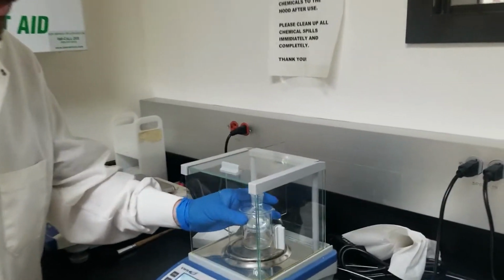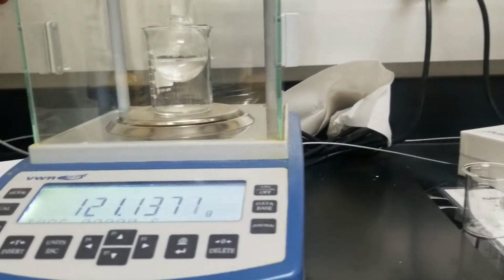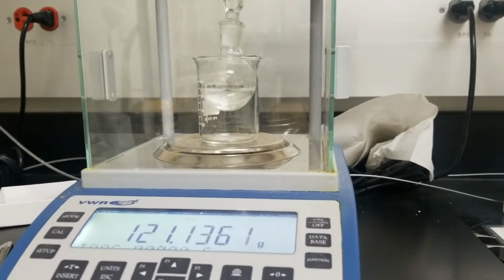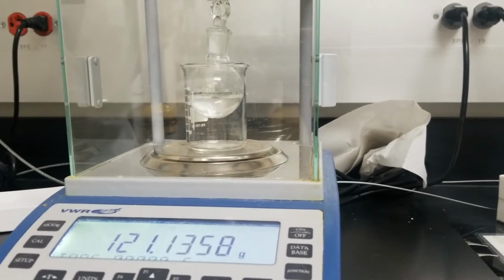Okay, so let's use this one. Okay, so minus 8, we're looking at about 13 grams, which should put us about 10 mils. It looks like a lot more than 10 in there. Yeah, I think you're probably fine.